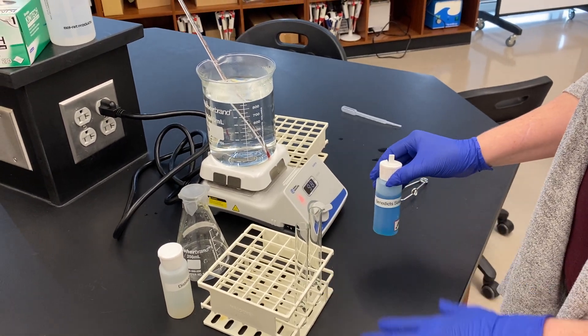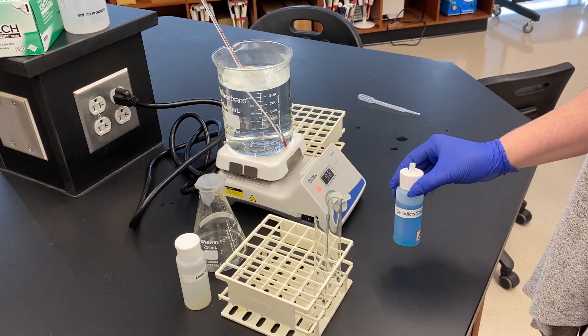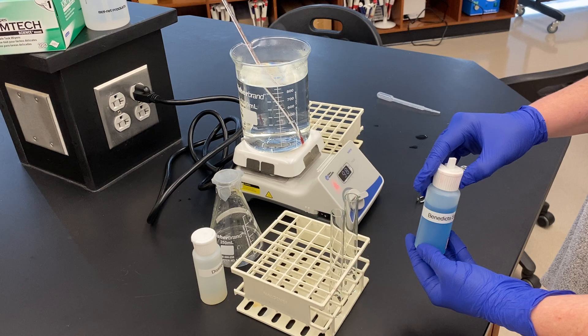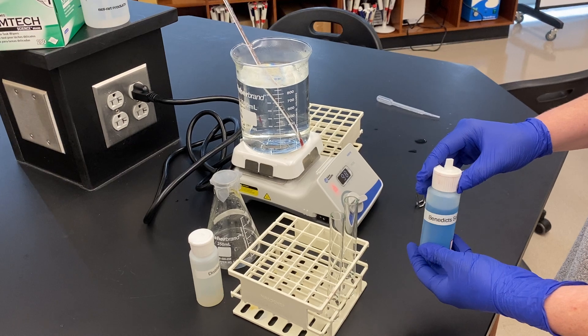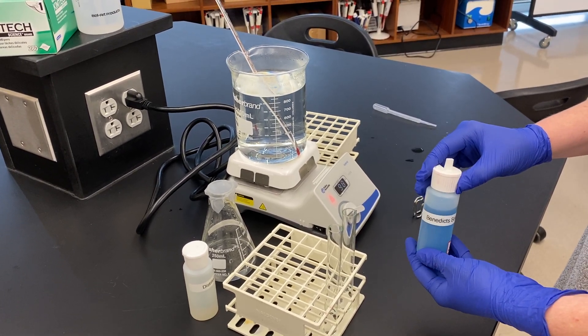In this demo we are going to talk about using the Benedict's test to examine for reducing sugars. The Benedict's test uses what's called Benedict's solution, which contains a copper compound, and what we're going to be examining is a redox reaction. We're going to look for the reduction of the copper, and it's going to change color.